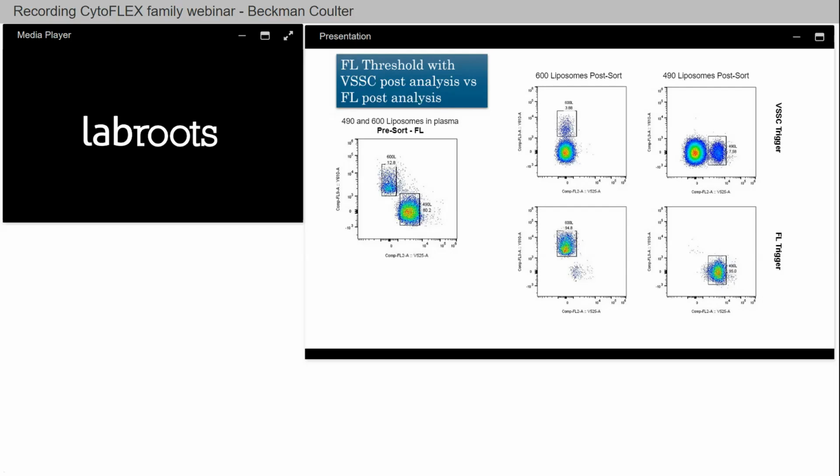Why are they basically going lower? And again, this is simply a factor of concentration. As we sort, we're actually diluting the sample a multitude of times considering the amount of particles. So you can concentrate them. That will give a little bit better because, as I said, concentration issue.